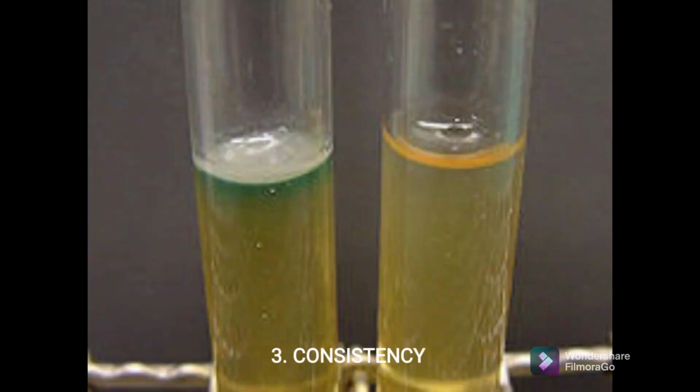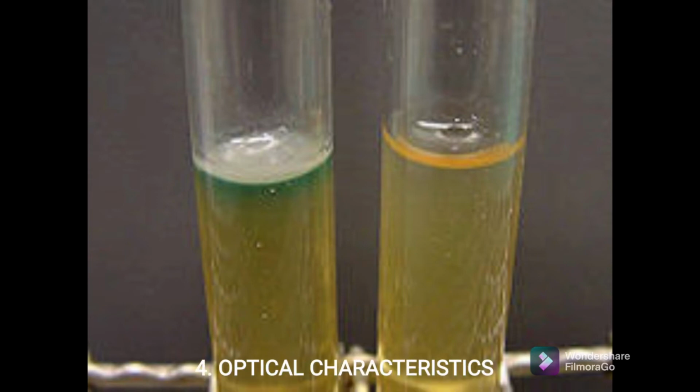Consistency. Viewed by transmitted light, the colonies were smooth, convex, opaque, glistening, entire, and pyocyanogenic. They were butyrous to the touch and produced a uniform turbidity when suspended in 0.85% sodium chloride. Optical characteristics. The colonies of the original culture of P. aeruginosa had a raised, opaque, glistening center bordered by a depressed, less opaque, dull concentric ring.